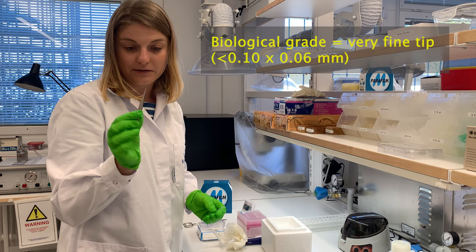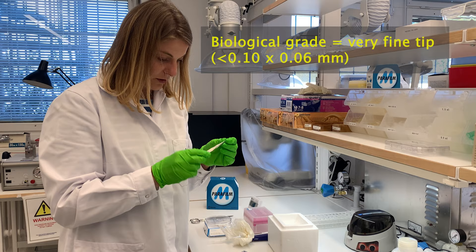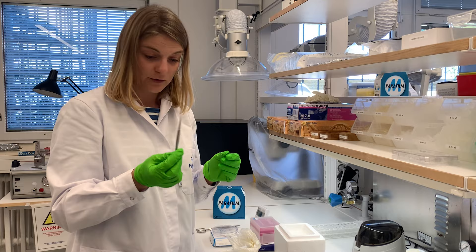So I have very fine forceps here. They are biological grade, which makes them best for handling grids which are very fine. You are welcome to ask us for some tips about where to purchase good forceps like this.